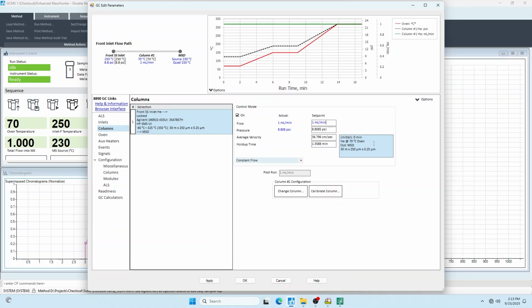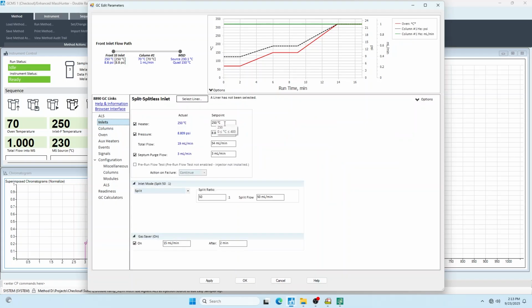The flow rate, unlike the GCFID, do not go faster here. You can really choke the mass spectrometer if you push too much gas through, so you really want to leave this at 1 mL/min. The inlet temperature is pretty important here. If it is too high, then you can really enhance thermal degradation of some compounds. If it's too low, you're not going to get signal for things.